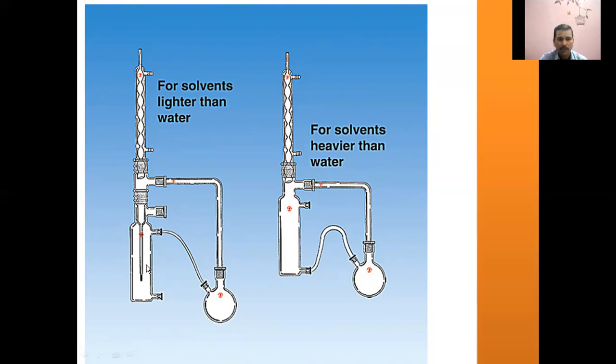So organic solvent, first evaporation takes place. The vapors of the organic solvent will be condensed back into liquids, and the organic solvent in the liquid phase will be made to pass into the aqueous phase. Then, because organic solvent is lighter than water, it will come up. Through this provision, organic solvent will come back to the reservoir by taking the analyte. So analyte has been collected in this particular reservoir back.